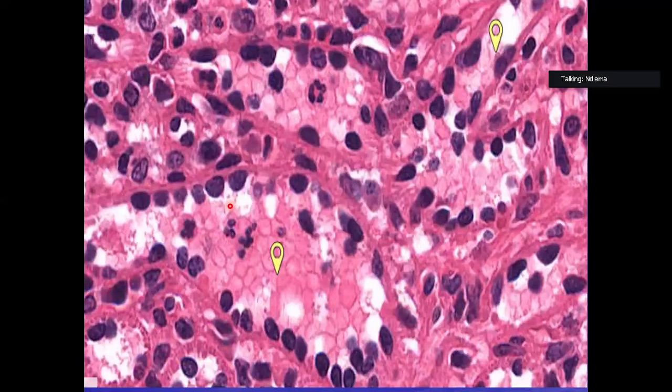This is the blood sinuses. These are the stave cells. They are rod-shaped. This is the lumen of the blood vessel, the sinus, with the normal blood cells, like these ones, the normal neutrophils, basophils, eosinophils. The normal formed elements of blood will be in these areas. These cells can get out into these areas, so with this area you can have the filtration of blood.